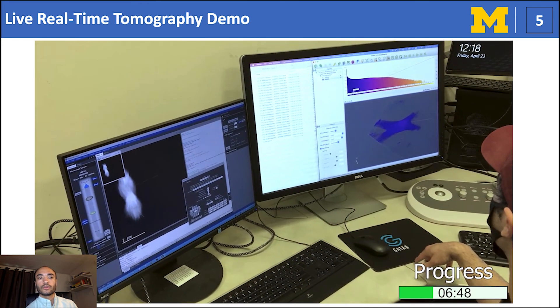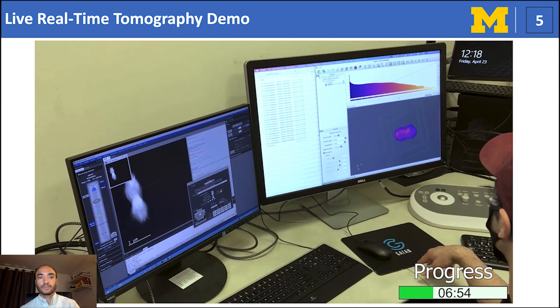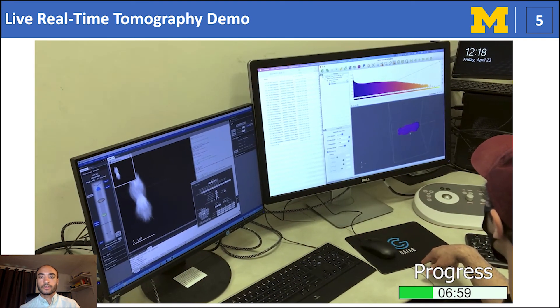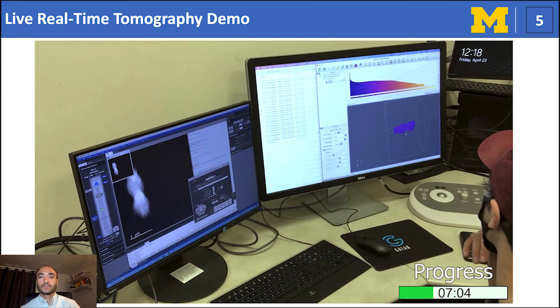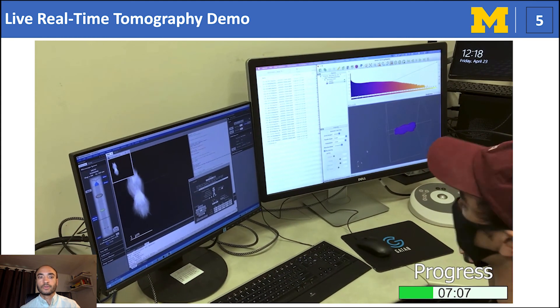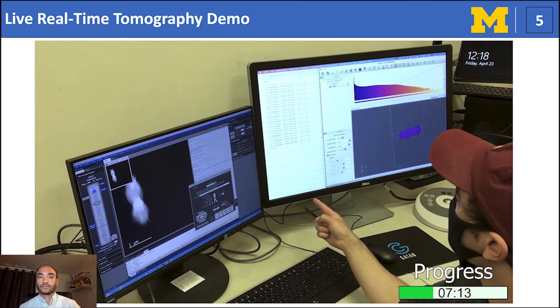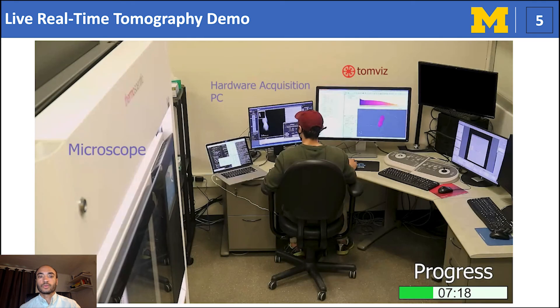Since we are only at 33% of the experiment, only a minimal amount of information is available. However, even at this stage, we are ready to discern general morphology. I can observe similarities between the 2D projection images and intermediate reconstruction to begin drawing scientific hypothesis of my specimen. While the experiment is ongoing, I can easily discuss the intermediate progress with any collaborators in the room. Now, let's continue and collect more projections.